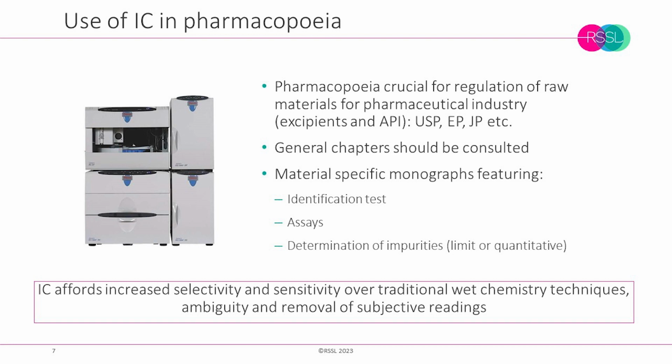Someone could ask why you are not using HPLC instead. HPLC is one of the most powerful analytical techniques in the modern laboratory. From research to manufacturing to legal, it is widely used in many sectors. However, there are some limitations. Ionic and polar compounds pose a challenge, so do organic acids. Moreover, some analytes, such as fluoride and chloride, are not active in the UV range, making it impossible to determine them with a UV detector, the detection which is most commonly used with HPLC.